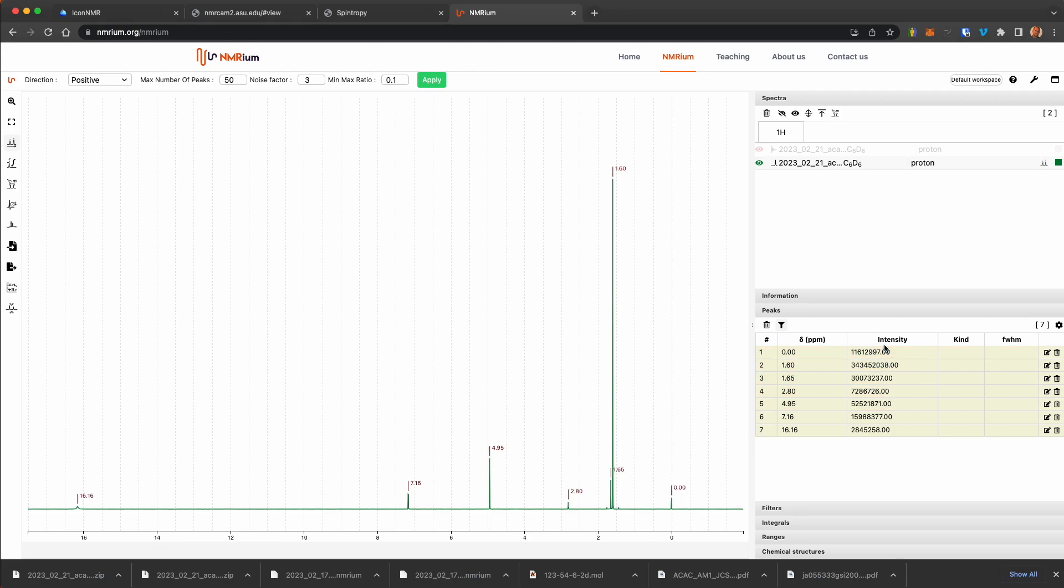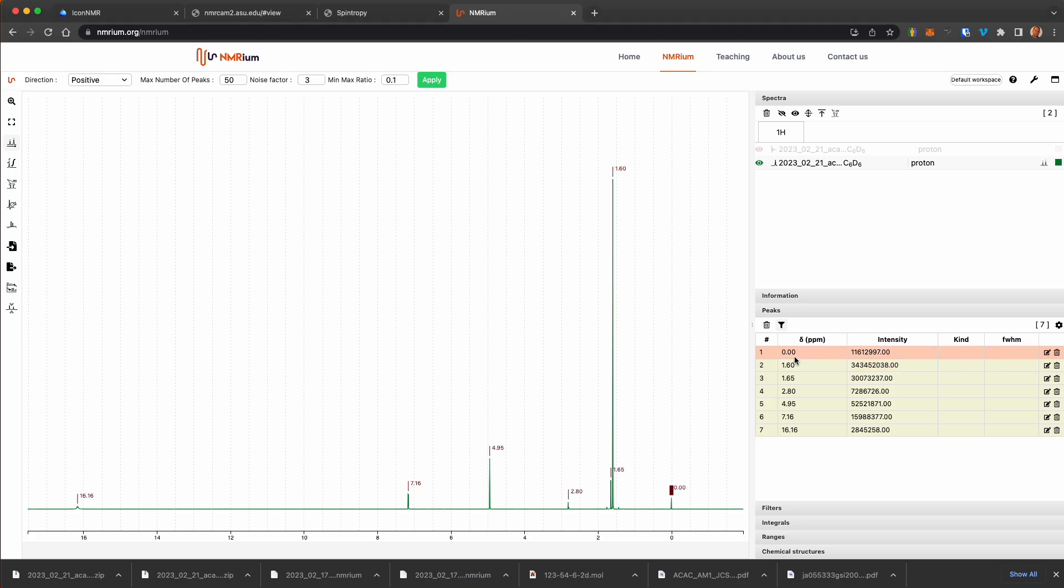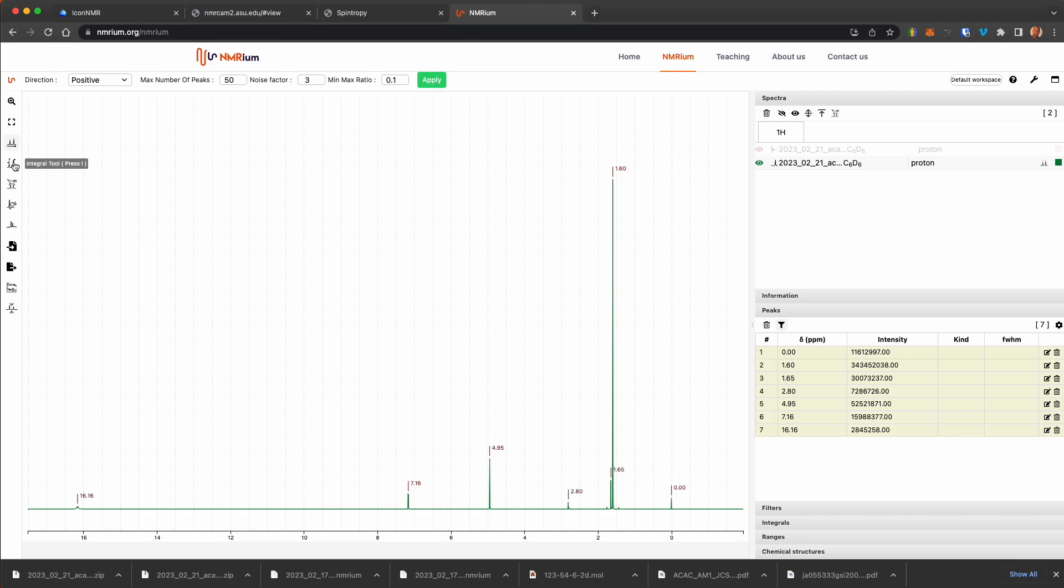Now, besides wanting to know the intensity in the exact chemical shift reference to TMS, the next thing you might want to do is to be able to integrate this so that you have the areas of these.